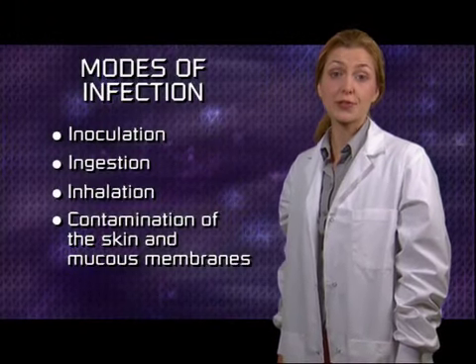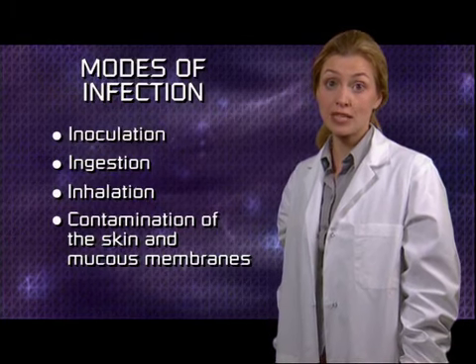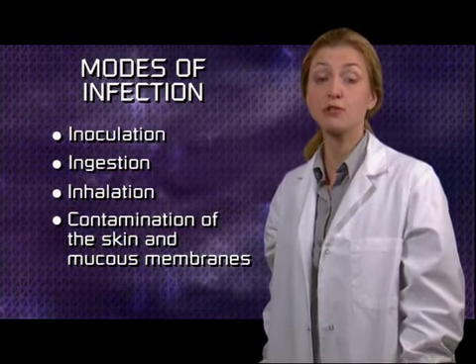All lab workers who handle infectious substances run the risk of being exposed to these pathogens, either by accident or through improper operational practices. The objective of these operational practices includes reducing the potential for the creation of aerosols. To reduce the risk of inoculation, it is recommended to avoid the use of glassware and to use plastic materials instead when possible. All accidents must be reported, even minor ones.